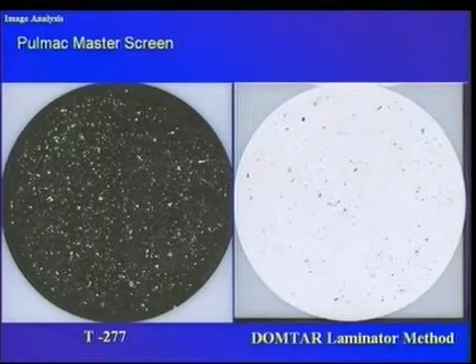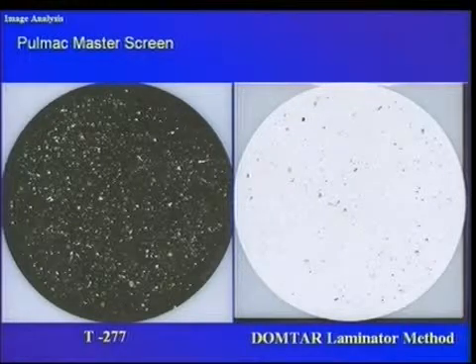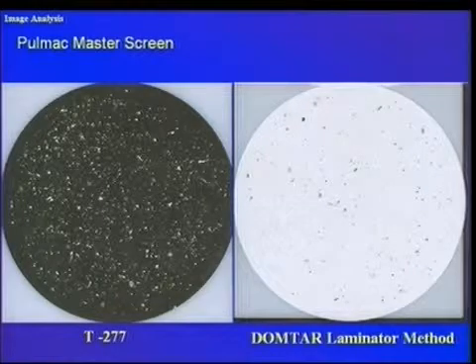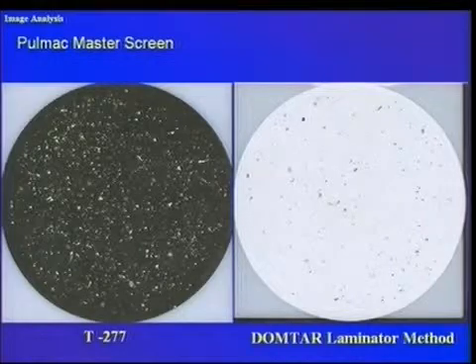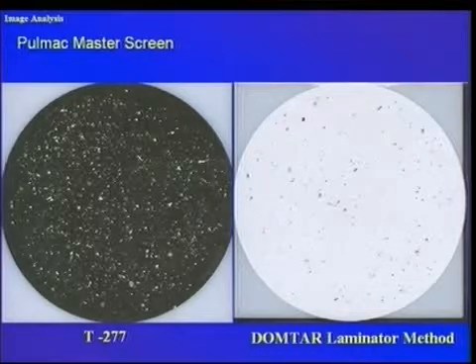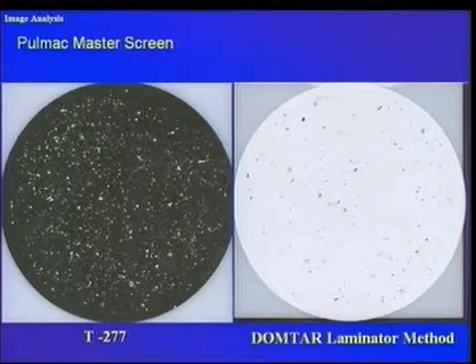The aluminum powder, or the Voith paper, has been placed over the top of the filter paper, put through the Carver press, and all of the residuals remain, and we can separate them in the image analysis system by their type. The fibers are separated from the stickies and reported separately, and the hairy stickies, those that are attached to fibers, are also analyzed as a separate item. The image analysis system in one scan can separate all three.